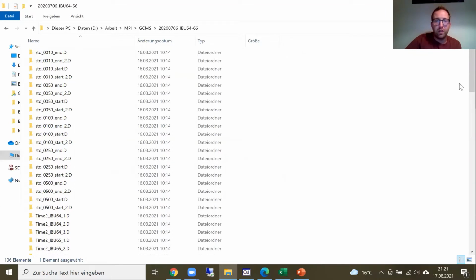And in our group, we are working on optimizing microbial cell factories to produce certain compounds of interest. And we do that by applying computational methods, but also methods from the wet lab. And in this short video, I just want to show you how we're using the GNPS dashboard to analyze our mass spec data. As I said, we're trying to optimize microbial cell factories.